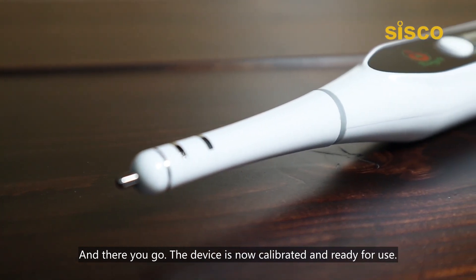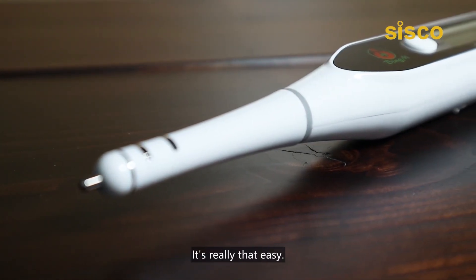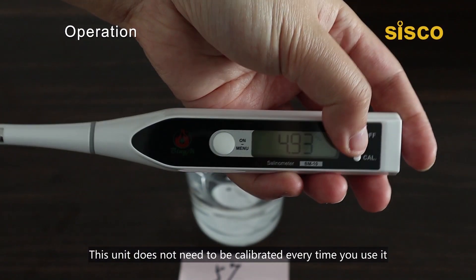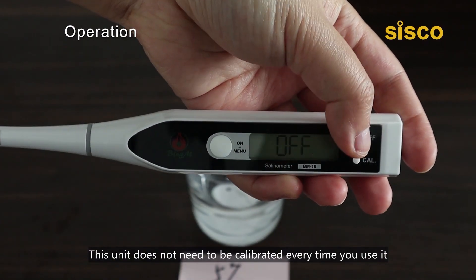The device is now calibrated and ready for use. It's really that easy. Before you go ahead and test your salinity, remember to rinse the tip with purified water and dry. This unit does not need to be calibrated every time you use it, as the pen resets itself to zero every time you turn on the unit.